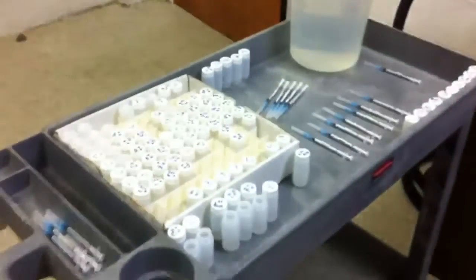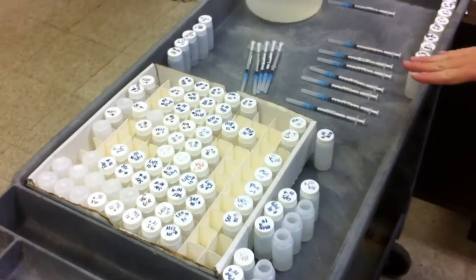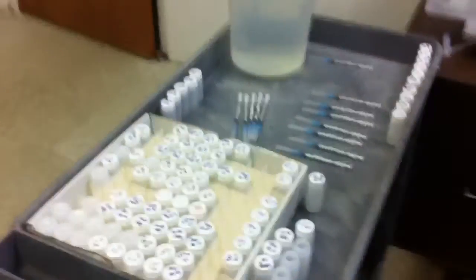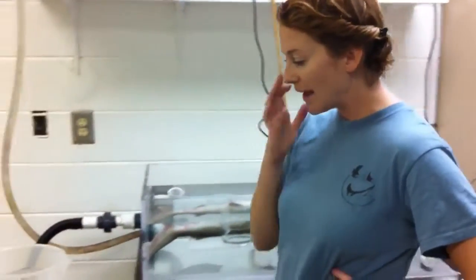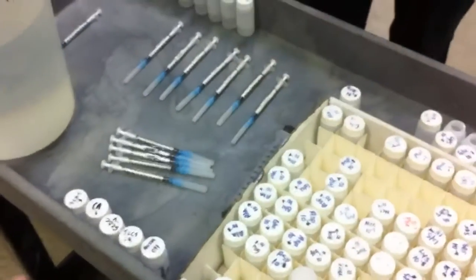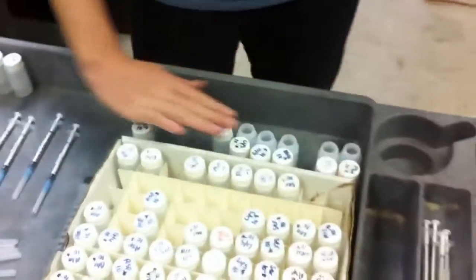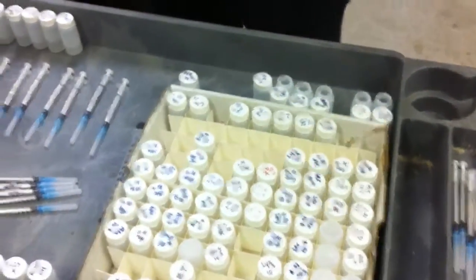So right now I'm testing. And that's all this stuff here? Uh-huh. These are all the odors I've mixed up. There's several different amino acids which stimulate fishes to feed. So it's like prey stimulating odors. And then I'm also testing some bile salts, which are sort of thought to be pheromone type odors. So those are the bile salts? Yeah, the bile salts are here, and then these are the amino acids. So yeah, I just spend all day injecting different odors at different concentrations.